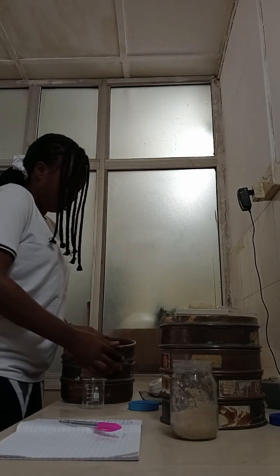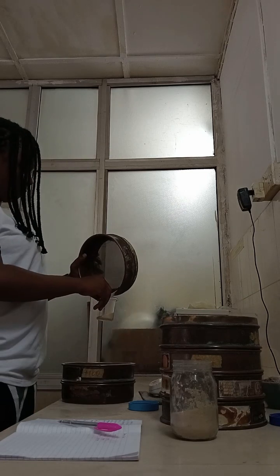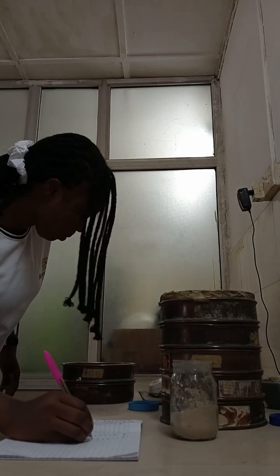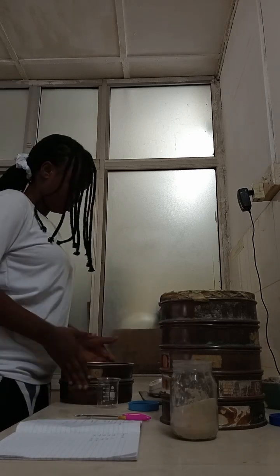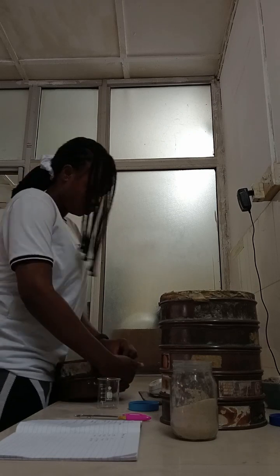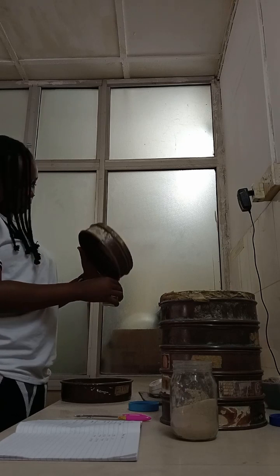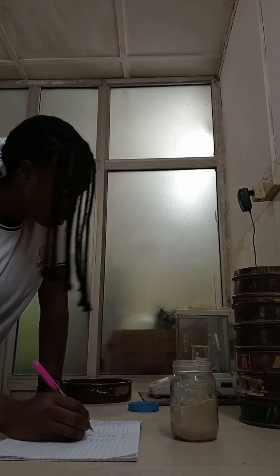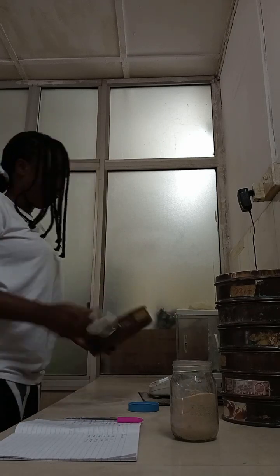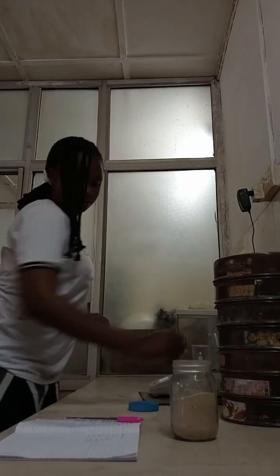This morning, as I just came in, my boss was like, Charity, come and collect, let's go and collect a sample and quickly do a sieve test on this. So I have to do it. Most times the disadvantage is that if we have more powdered form of this particular sample, it is a disadvantage to the company, because when they place it into the machine and the machine starts rolling, this dust flies away and we don't get the real one. So there's a particular size we want more so that it can give us what we want.